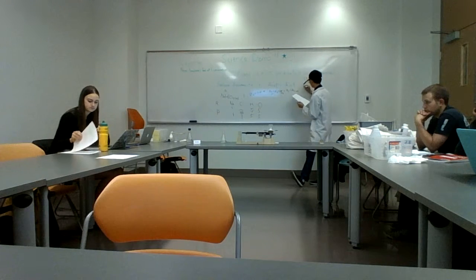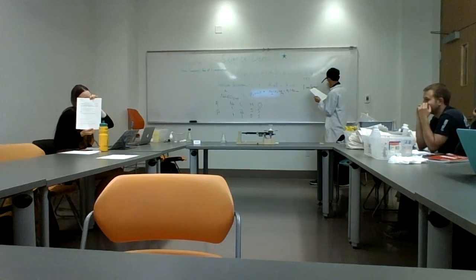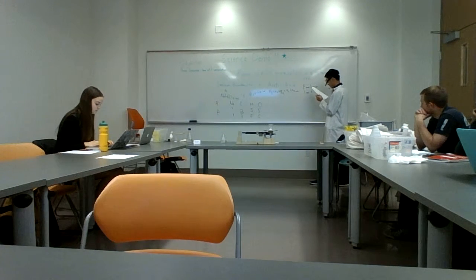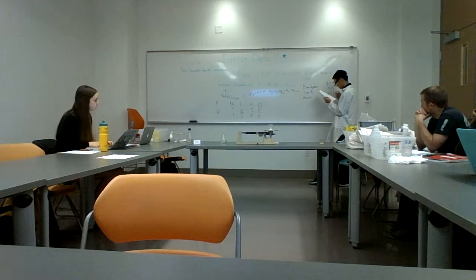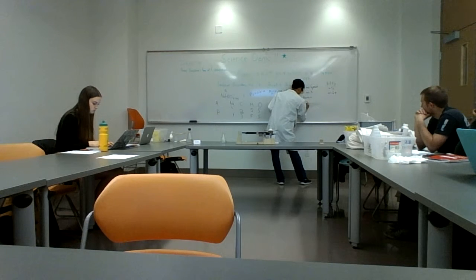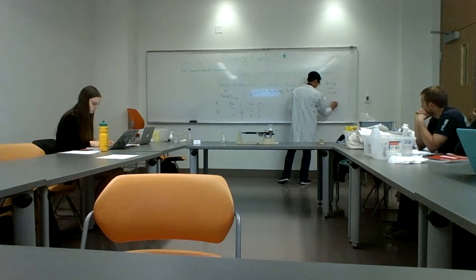We have an Erlenmeyer flask. We have the acetic acid, which I measured as 100 milliliters, but it's 91.6 grams, and baking soda, sodium bicarbonate, has 5 grams, with a total of 201.7 grams.